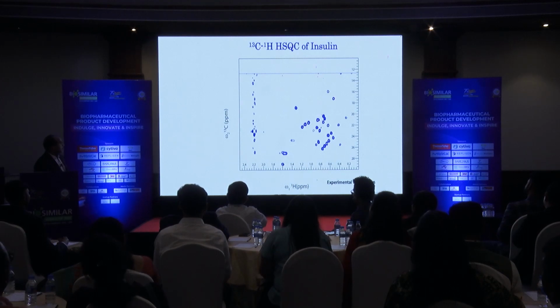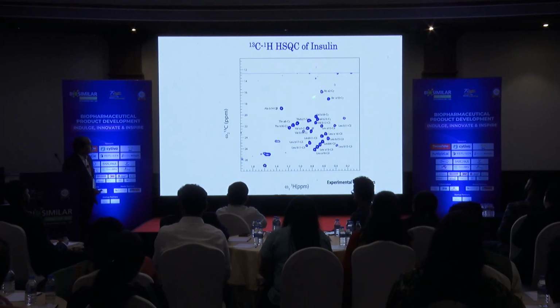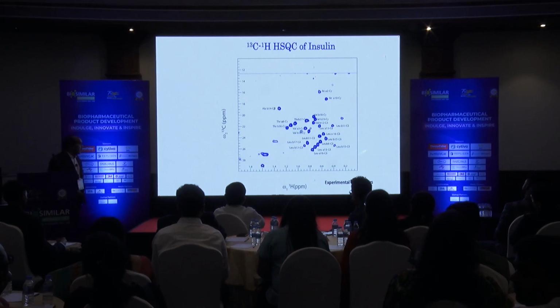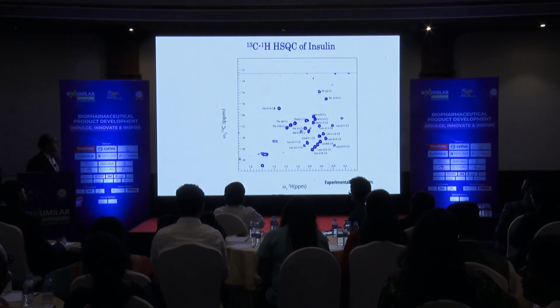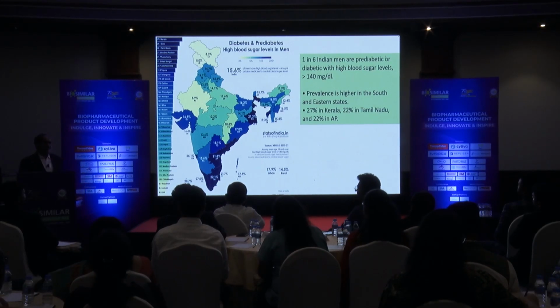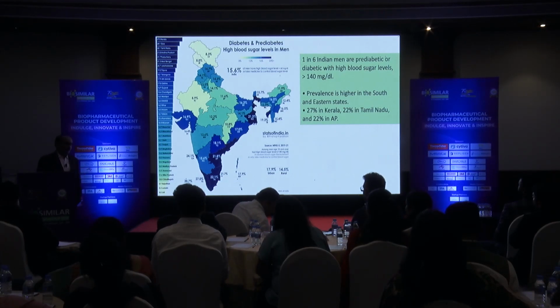Next, please. And now you can see this signal is coming from isoleucine A2 or A10 or alanine B14 C beta. So now we are talking in a residue-specific manner or even a moiety-specific manner, and this gives us lots of confidence that we can do a lot. Next, please. Okay, so from here onwards I am going to focus on something that we did on diabetes-related therapeutics, peptides, insulin, and this has emerged because of the collaboration of NII with Biocon.